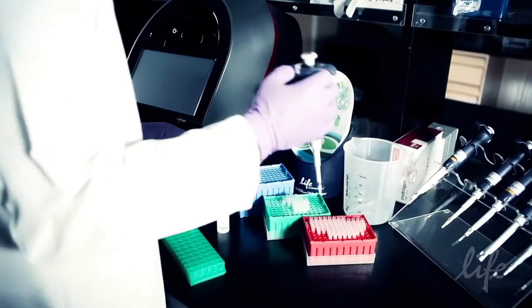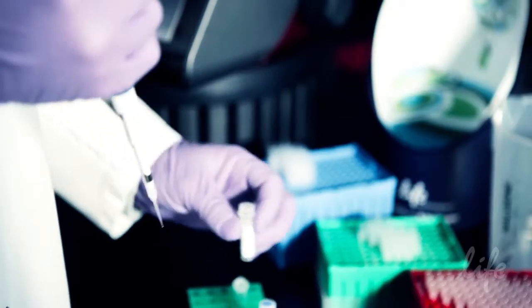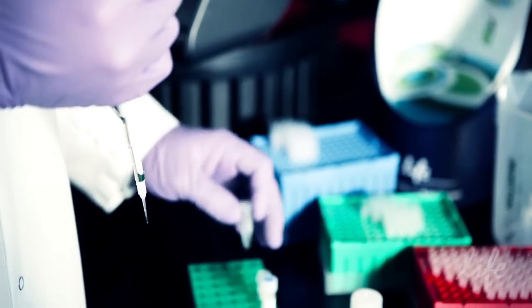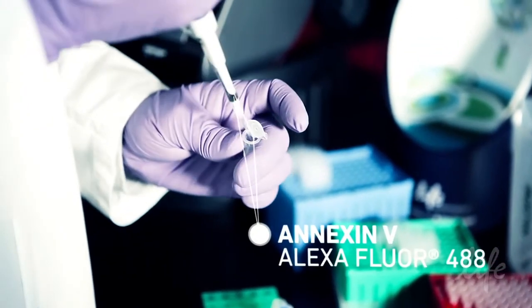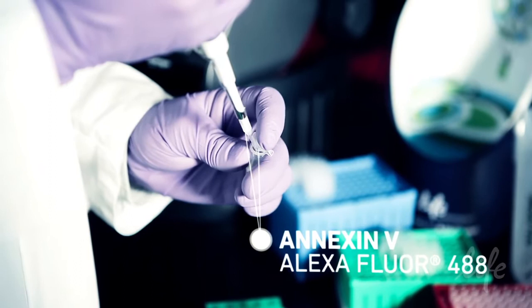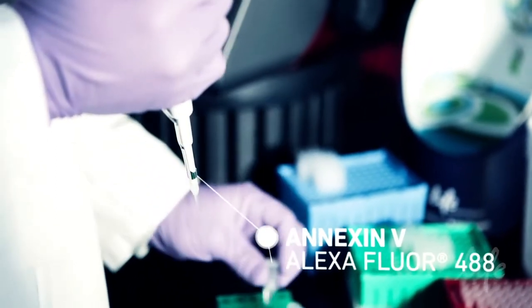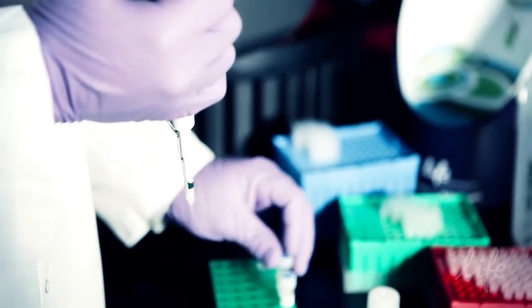The Tally apoptosis assay is Annexin V based. Annexin V labeled with Alexa Fluor 488 can identify apoptotic cells by binding to phosphatidylserine exposed on the outer leaflet.